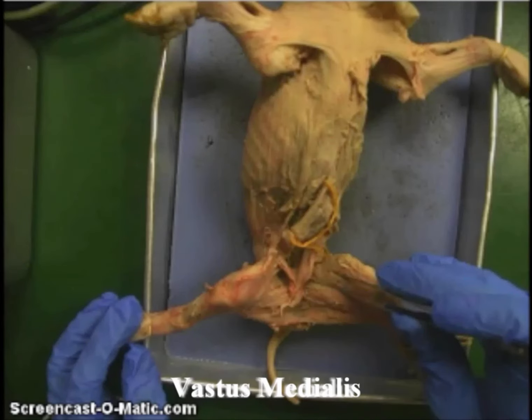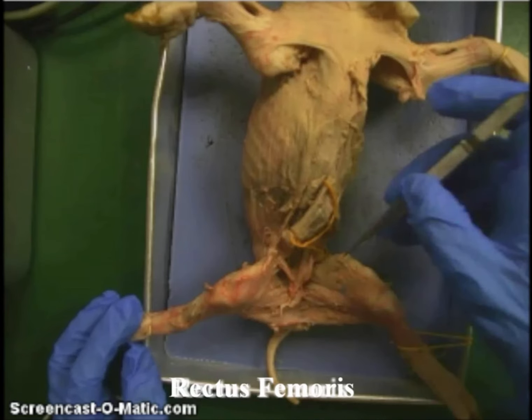This first one right there is the vastus medialis, which should make sense since you are looking at the medial view of the pig's leg rather than the lateral view of the pig's leg. So that's the vastus medialis. This top part there is the rectus femoris. Right there.